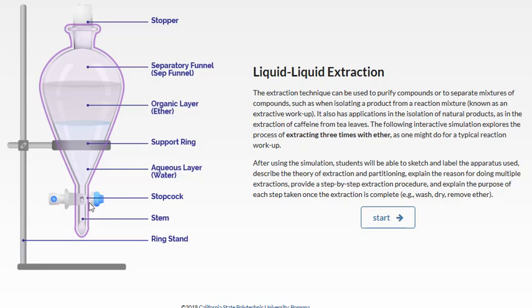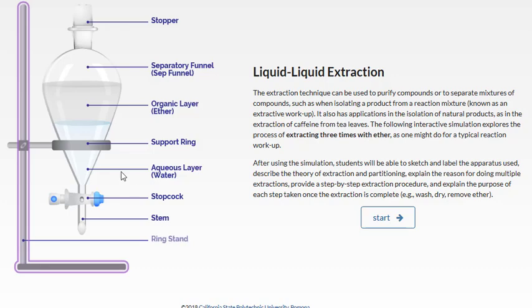If it's ground glass, you want to use the smallest amount of grease as possible because we don't want to contaminate our solutions with that. A lot of times we have a plastic one up top. This is all going to be supported by a ring stand and a support ring that allows the sep funnel to rest in it, so we can take it in and out very easily without having to clamp and unclamp it each time.